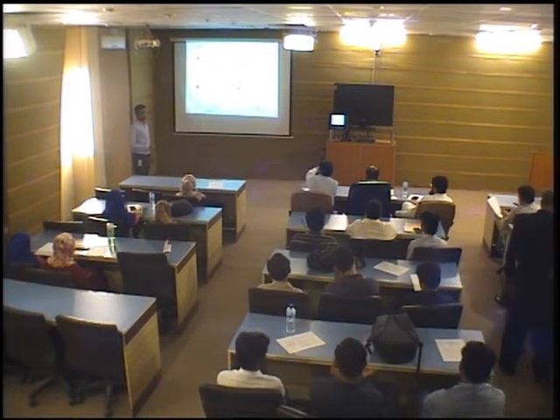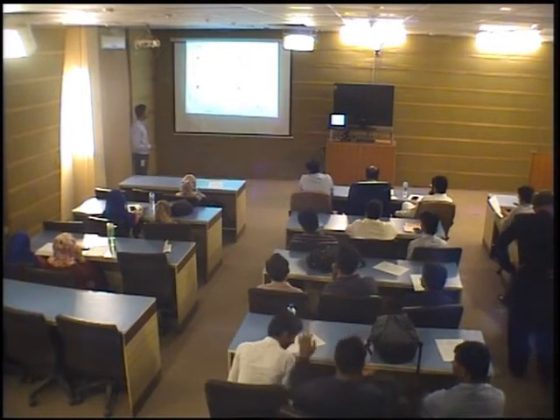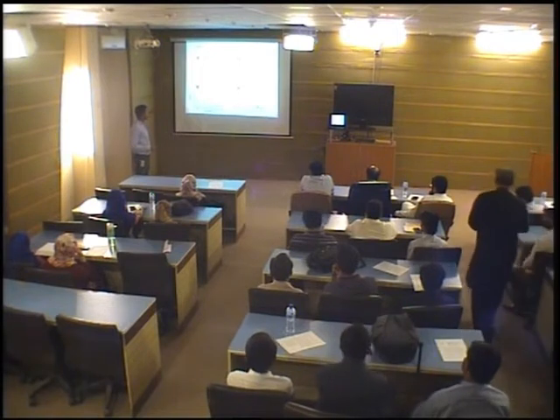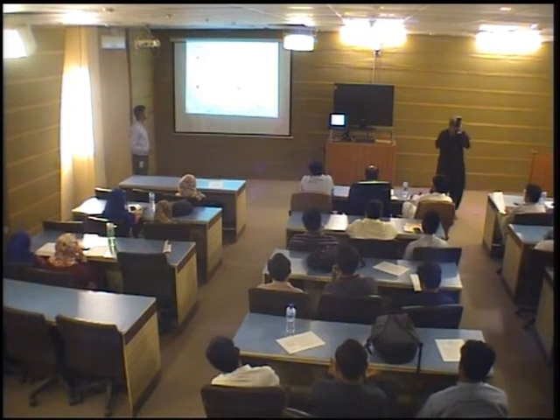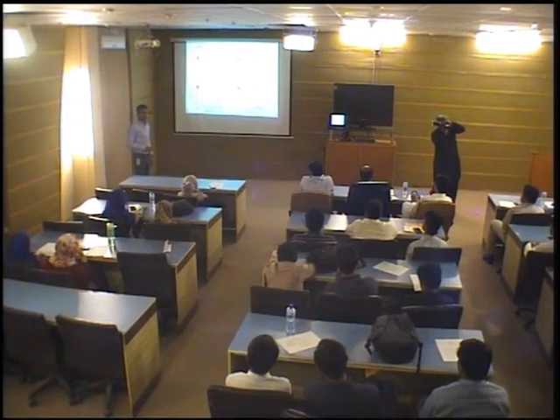Again, same pattern, this whole spectrum is divided into small portions. In figure A, the range of this picture is from 330 to 340. This is the bunch of titanium, while in figure B, its range is from 381 to 396. Almost we have found 3 magnesium lines, 1 iron, 2 calcium, 2 aluminum and 2 titanium lines.